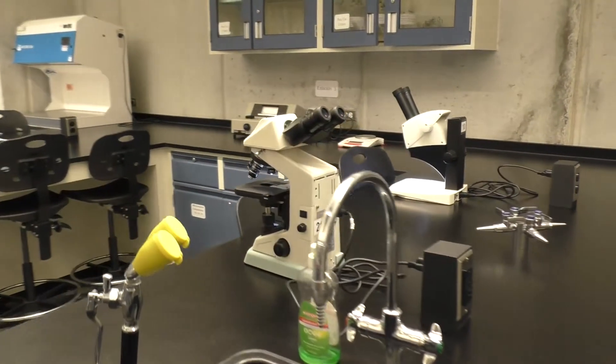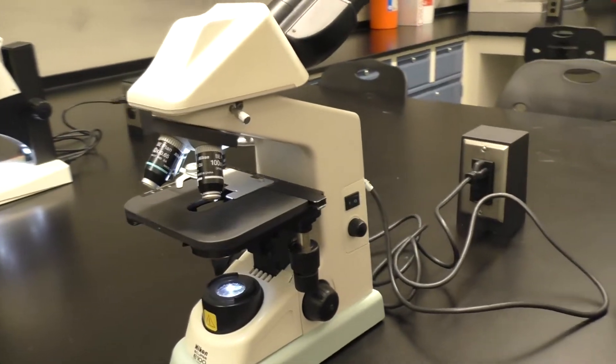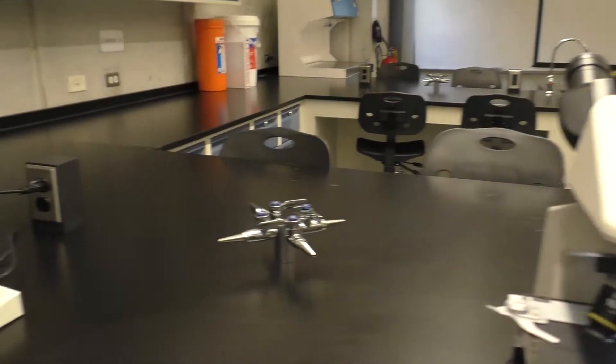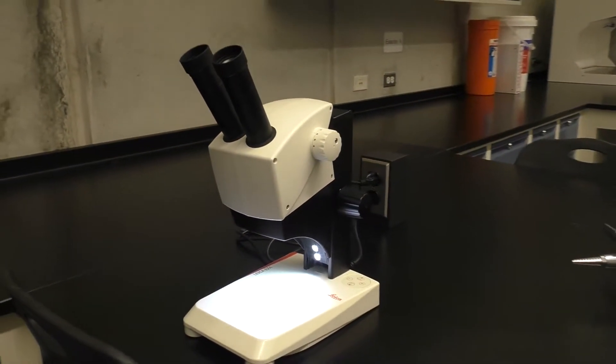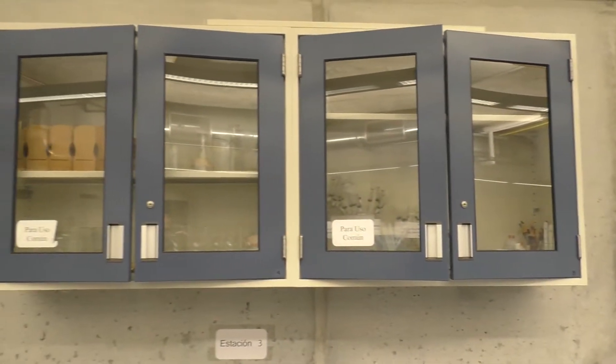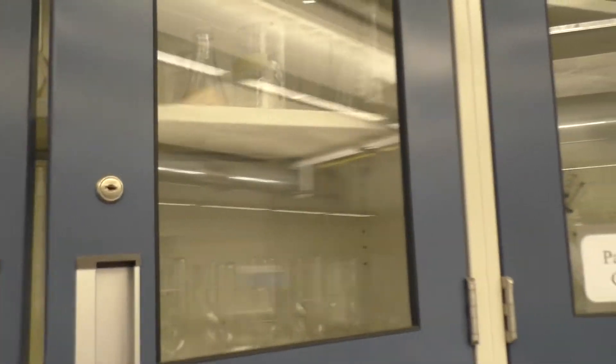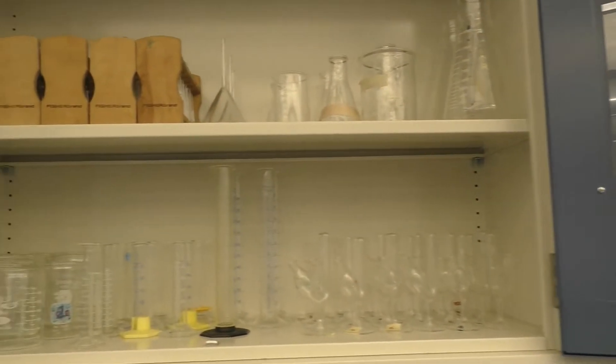Our students can observe microorganisms and microscopic structures using compound microscopes and dissecting microscopes. We also have standard lab glassware and tools that the students can use to perform the different activities.